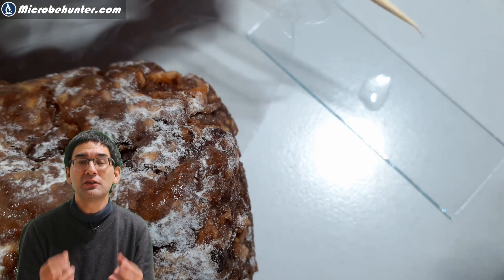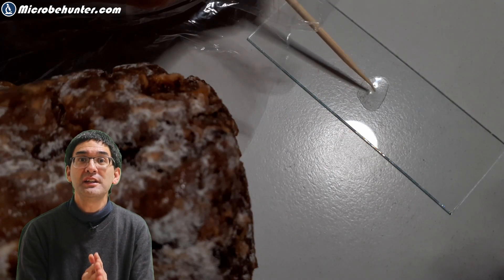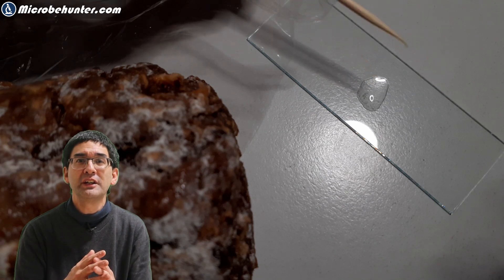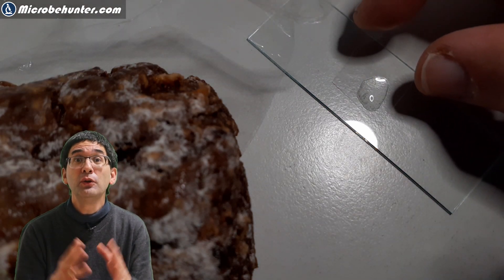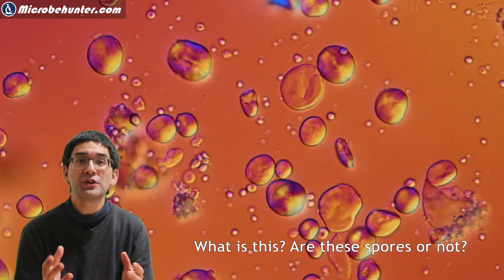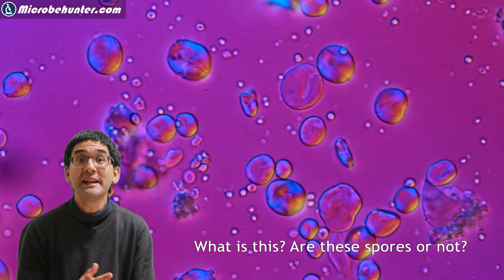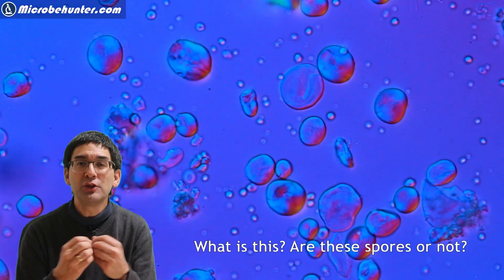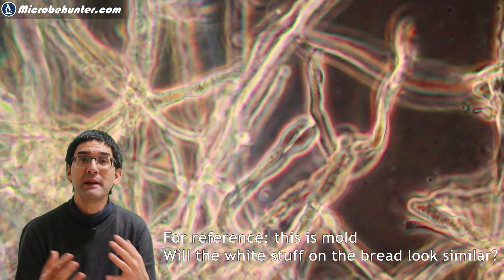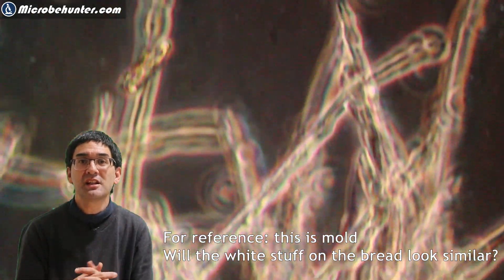Now if it is a fungus then I expect to see three different things. First, of course, spores — these should be round or oval structures, more or less regular in shape and size. Second, fungal hyphae: these are long thread-like cells of the fungus that make it appear fuzzy. And third, so-called sporangia — the parts of the fungus that actually produce the spores — and I expect the spores to be aggregated and clustered around these sporangia.